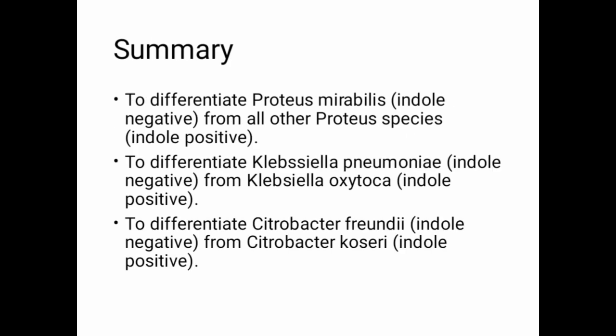At last, the summary of the topic is that the indole test is performed to differentiate certain bacterial species from each other. Certain bacteria are indole positive, while others are indole negative.